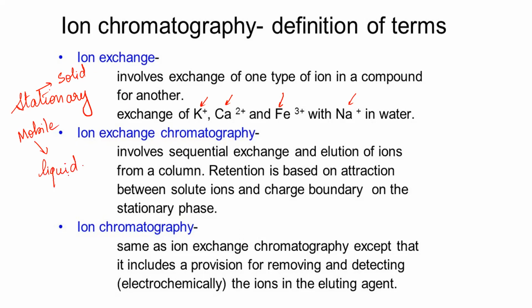All types of chromatography that we are discussing are based on the interaction between the stationary phase and the mobile phase. Like what we saw in gel permeation, the stationary phase has to be inert, because the best separation can be achieved if there is a desired interaction between the stationary and the mobile phase.